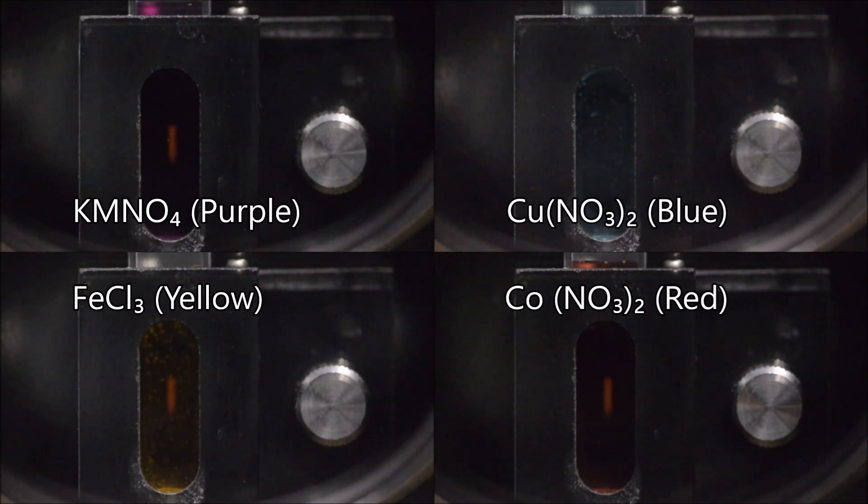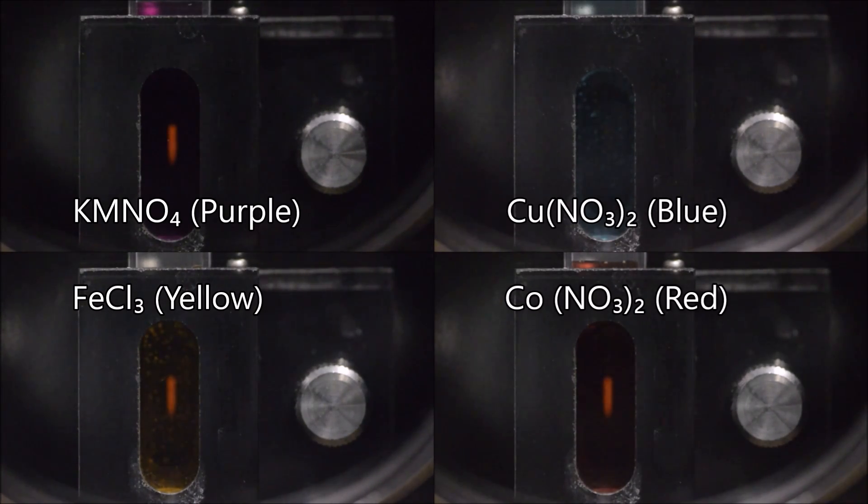But it does make sense why we would use red light to measure the amount of copper sulfate or blue appearing material in a solution.